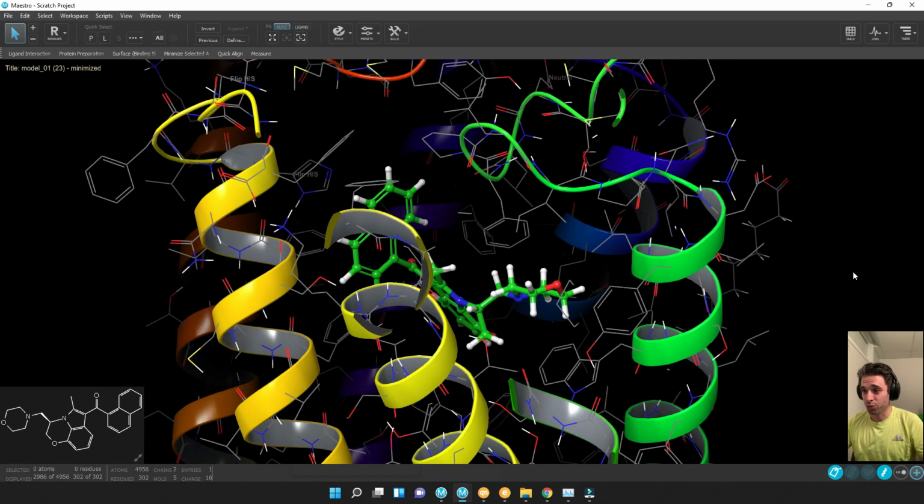And I think that's where I'll leave it for today. Kind of in summary, what we did today was look at how to further prepare and refine our structure for an actual ligand drug discovery, which is what we'll get into next time. With that being said, I hope you found this video informative, and I hope you're enjoying this series. And this can be applied for any GPCR.